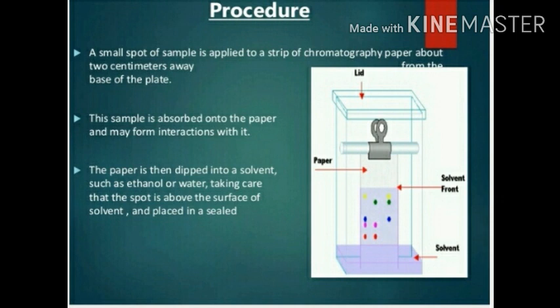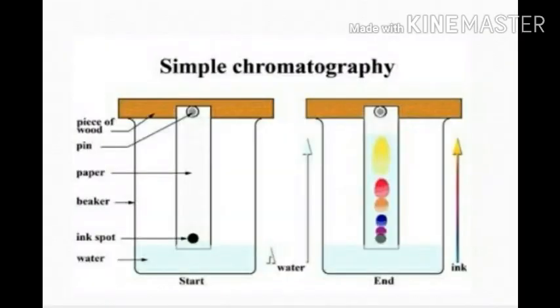Just look, two phases are present in chromatography: one is the stationary phase and the other is the mobile phase, and this is how the experimental setup is.